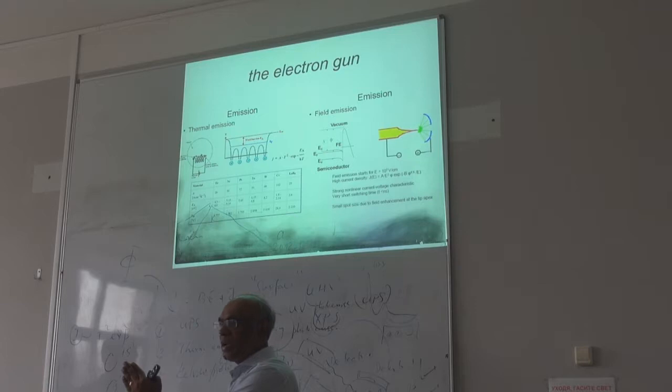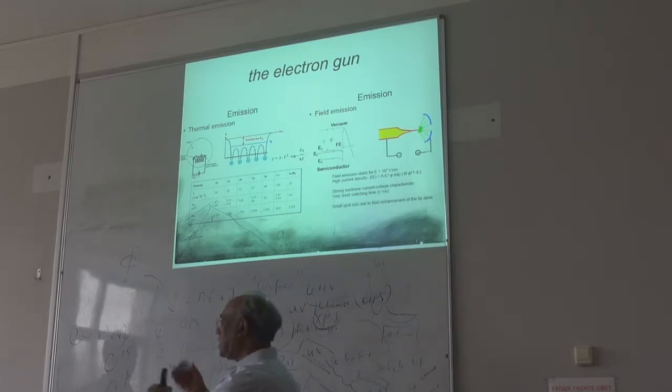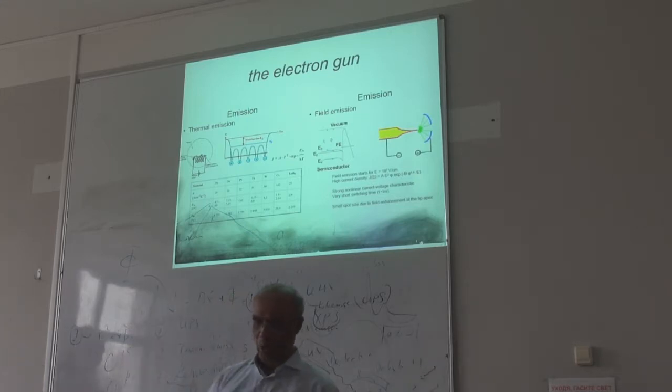When you make this contact, what will happen? They will try to equilibrate, and you get the same potential. Then you can look at something called the offset voltage. Basically you are measuring the voltage across these two, and by doing that you can get the Fermi energy. That's called the Kelvin probe. Maybe next time I'll talk about that.